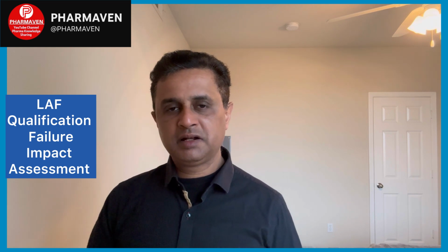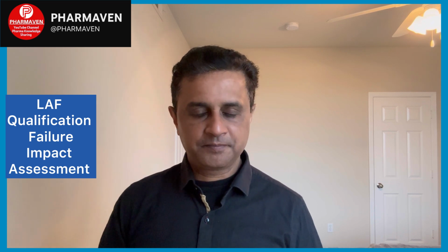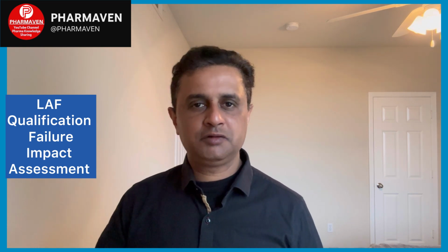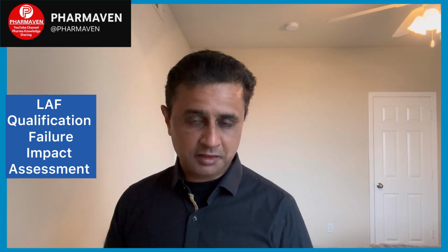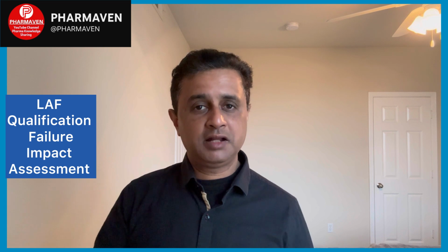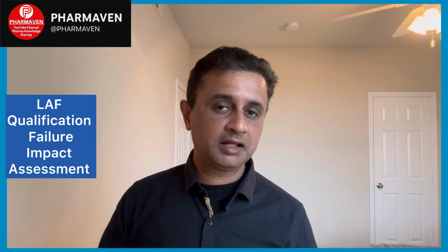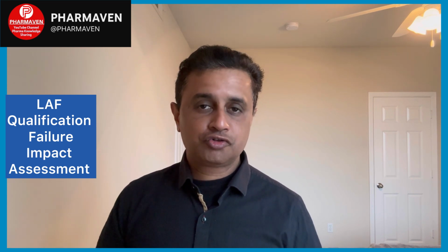The final decision can ultimately be made based on the overall details and finished product testing. If the LAF is not used in product processing, and is used for an activity which is not product related, such as testing, or any other LAF station not directly related to the product, then there will be no impact on the product. But we still have to perform the impact assessment for the uses of that HEPA filter and that LAF workstation, and based on that the entire conclusion has to be drawn.